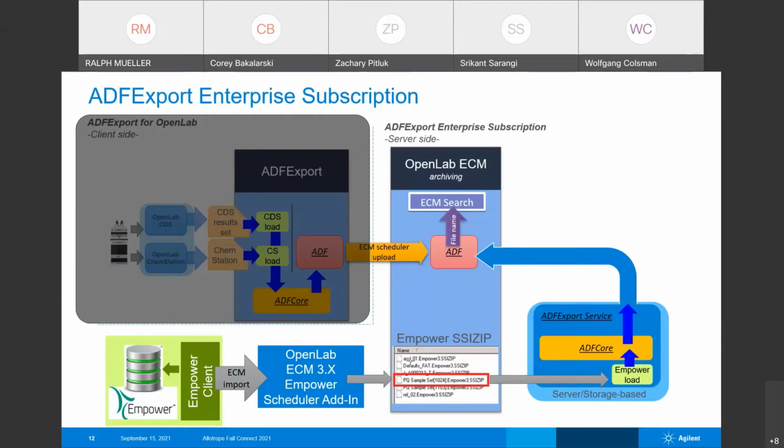Here we are doing via the ADF core, the framework 1.5.1, the newest one, this conversion into ADF and injecting from this service the ADF into ECM.